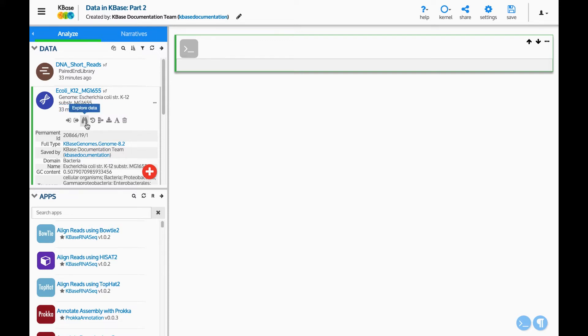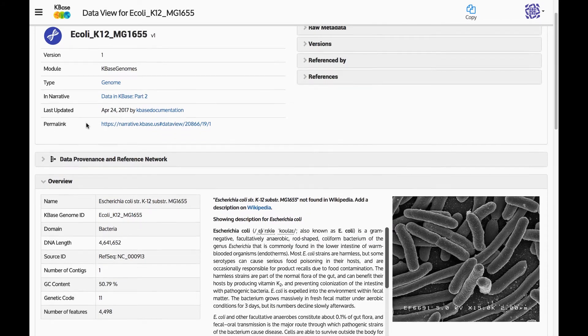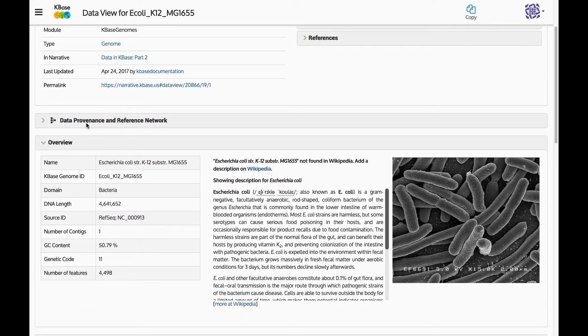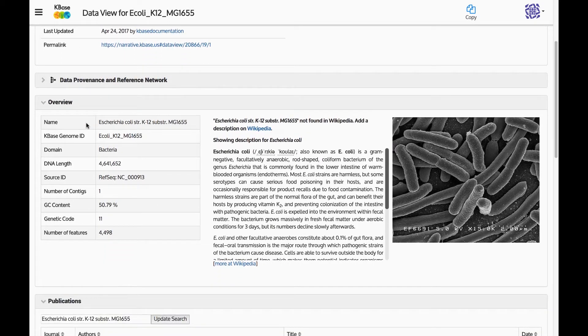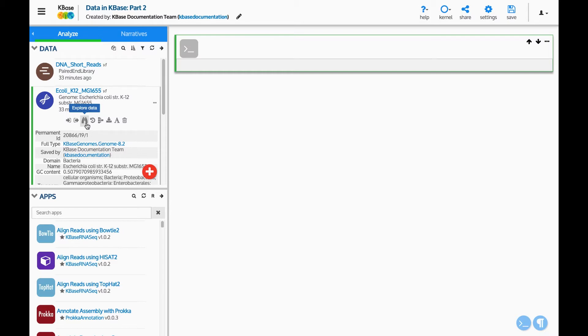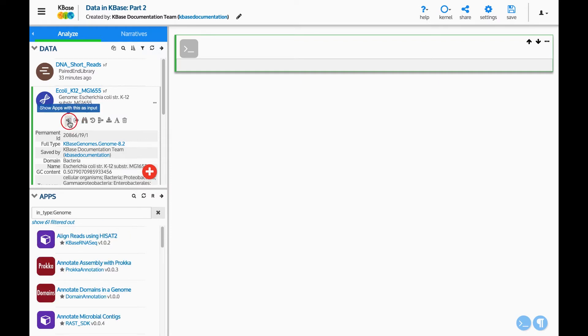The binoculars button pulls up a landing page for the data. This will launch a new window with information about the genome. The last two buttons filter the apps to show only apps that create this type of data or that use this type of data as input.